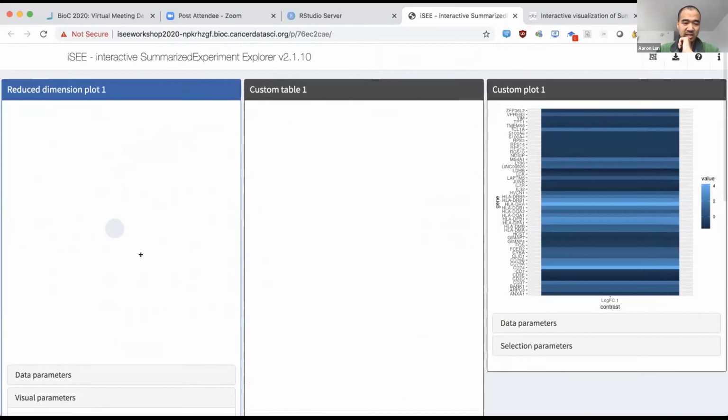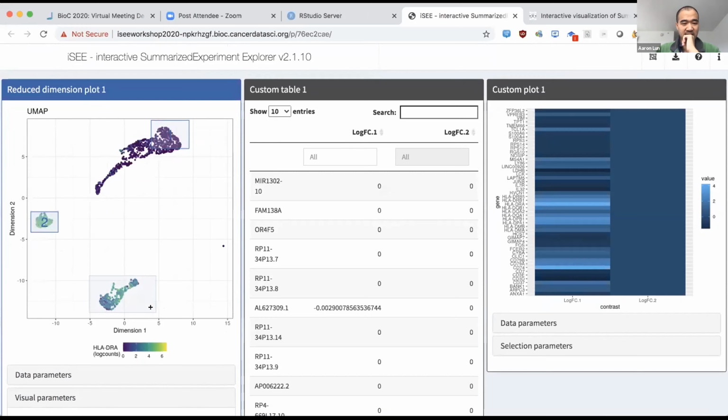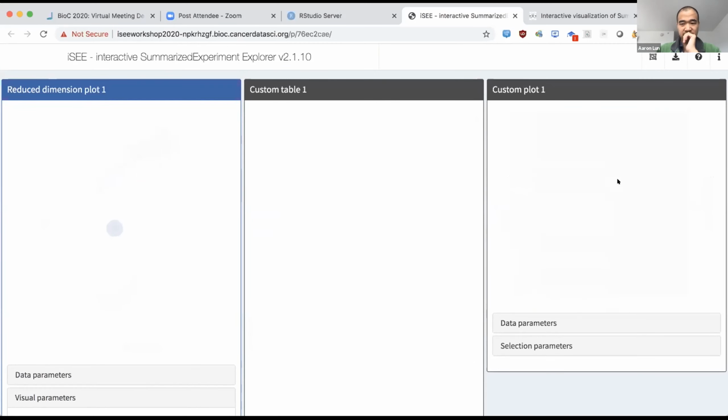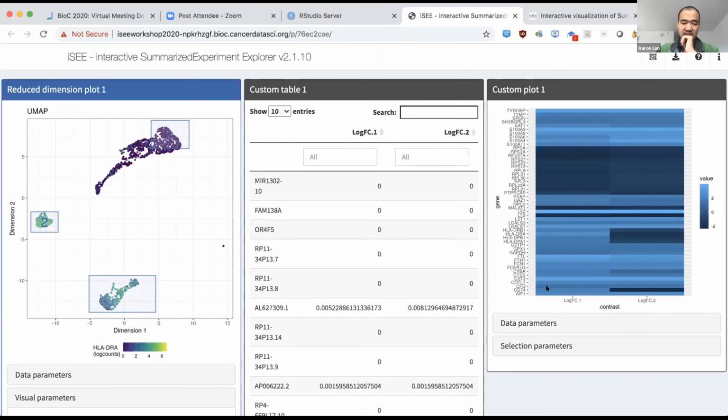So if I save this one, and then I make another selection here, what will happen is that this heat map will now have the log fold change of the active selection, which is this one without the number, against selection number 1 and selection number 2, right? This heat map is not very pretty, but you could stack this up with more and more selections to figure out which are your top genes that differentiate one cluster against any number of other specified clusters.